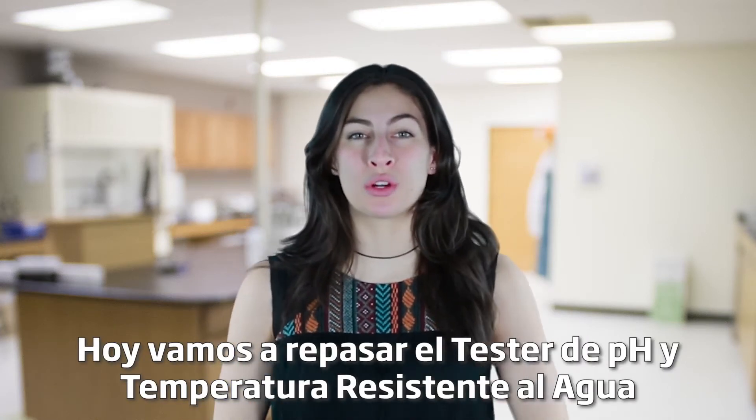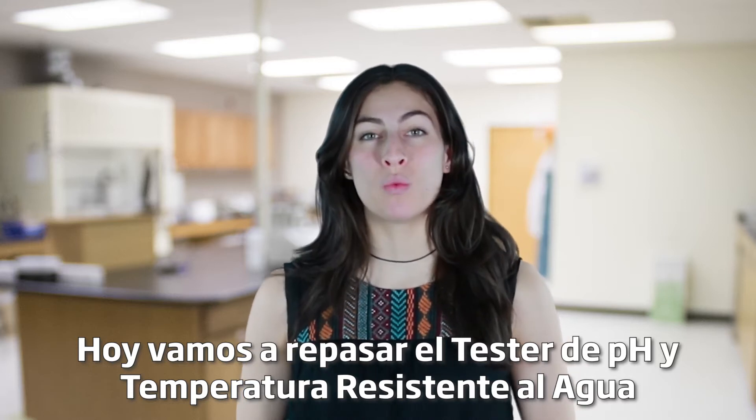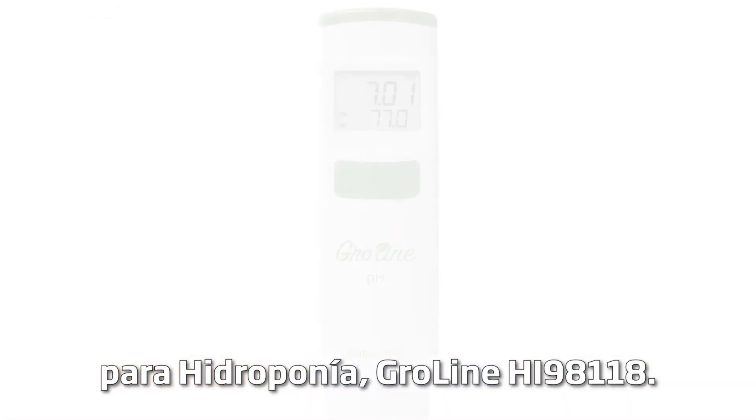Hey guys, welcome to the HANA Lab. Today we're going to go over the Waterproof HI-98118 Growline pH and Temperature Tester for Hydroponics.